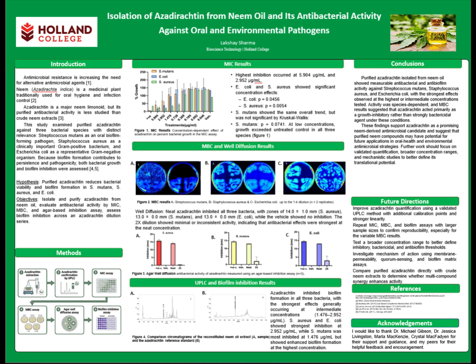So to conclude, purified azadirachtin isolated from neem oil showed measurable antibacterial and antibiofilm activity against S. mutans, S. aureus, and E. coli, the strongest effect being seen at the highest or intermediate concentrations. And overall, the compound appeared to act mainly as a bacteriostatic agent under these conditions. These findings support my hypothesis and show azadirachtin to be a promising plant-derived antimicrobial lead for further study.